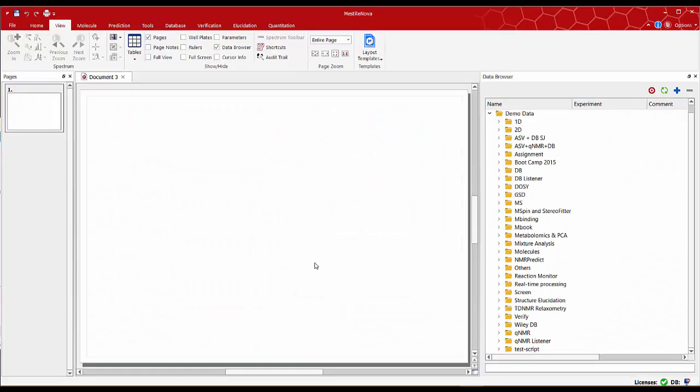Hello everybody, in this short clip I would like to show you how to quickly open, process, analyze and report a proton NMR spectrum using the latest ribbon control interface integrated with MNOVA12.